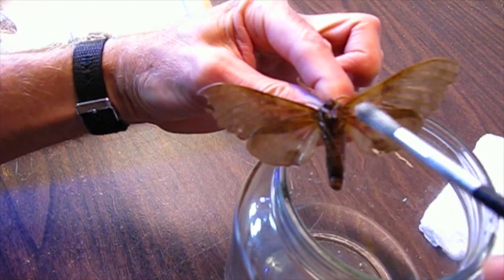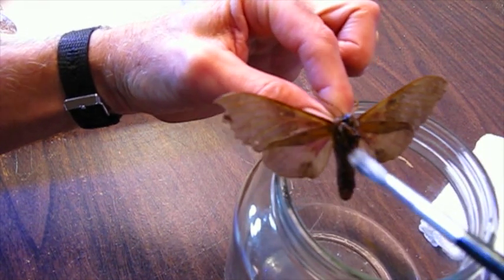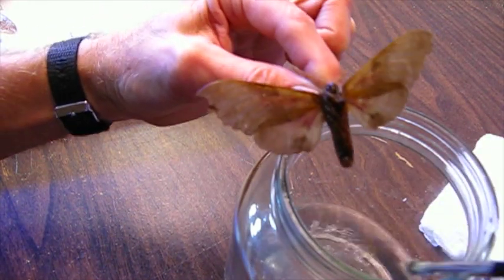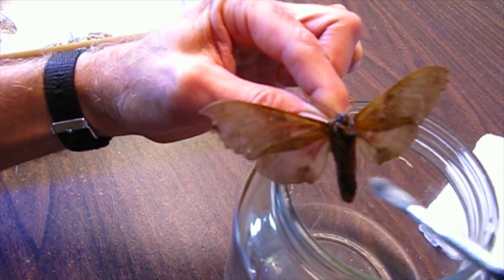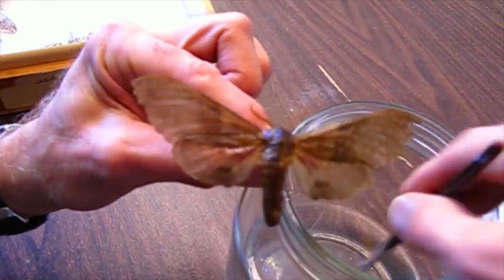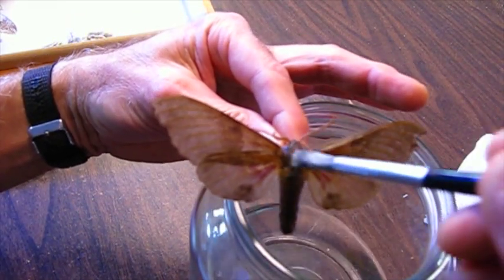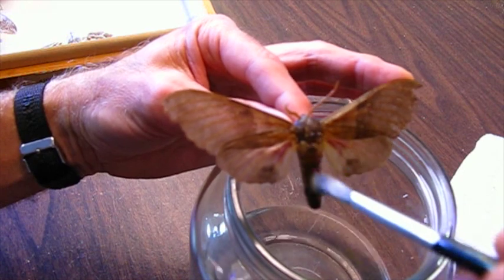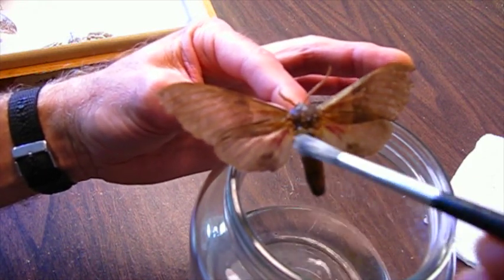It's a good lesson in paying attention to your collection. I've been, as I say, I moved last winter and it's been a pretty crazy busy year with the pandemic and everything. It's been kind of up in the air and I could have caught this if I inspected it. I know this wasn't like this when I moved because I looked at all the boxes and I would have noticed it. Nonetheless, it's better to catch it earlier than later.